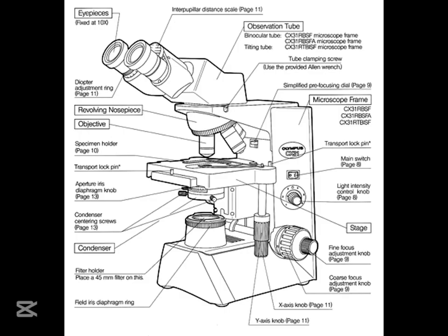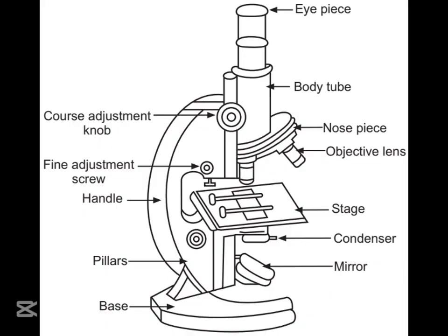What if I see something totally new, something I've never seen before? Document it. Draw what you see, take notes, or even take pictures if your microscope has a camera, and share your discoveries with others. It's a great way to learn and inspire people. So it's not just about seeing, it's about recording and sharing. Like a real scientist. Exactly. And remember, every scientist started somewhere. Maybe one of Mr. Martin's students will make the next big discovery using a microscope. Wouldn't that be amazing? Okay, before we wrap up, anything else important to remember about microscopes?